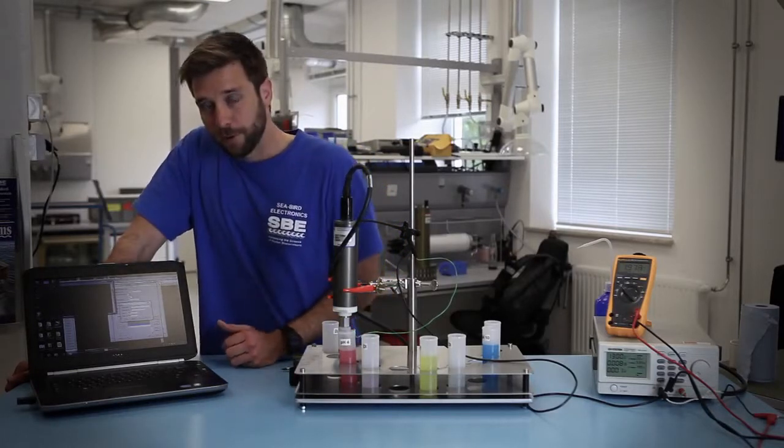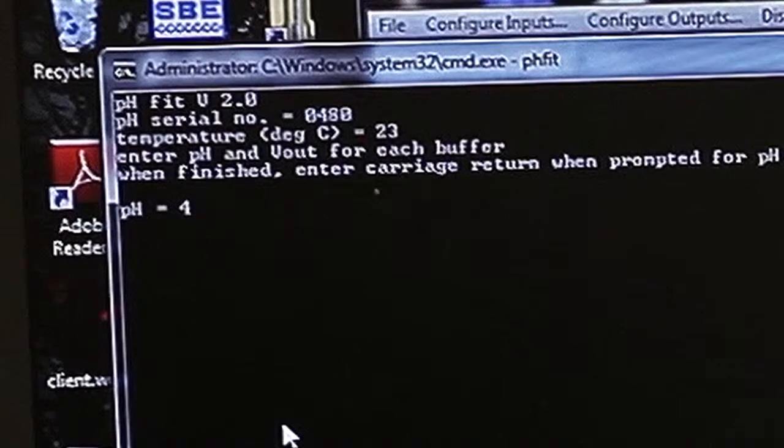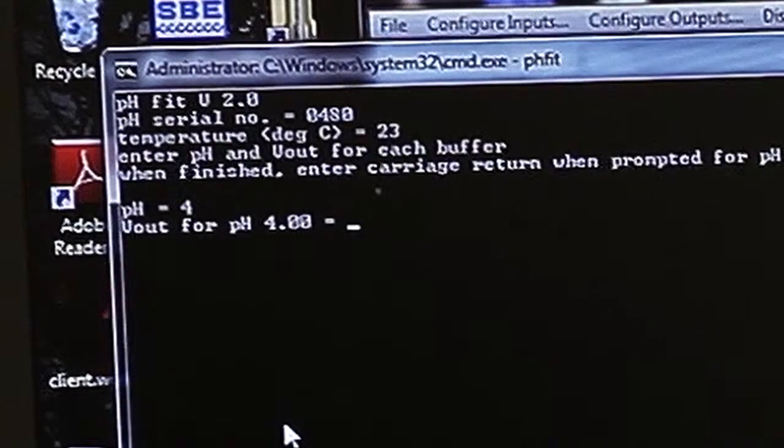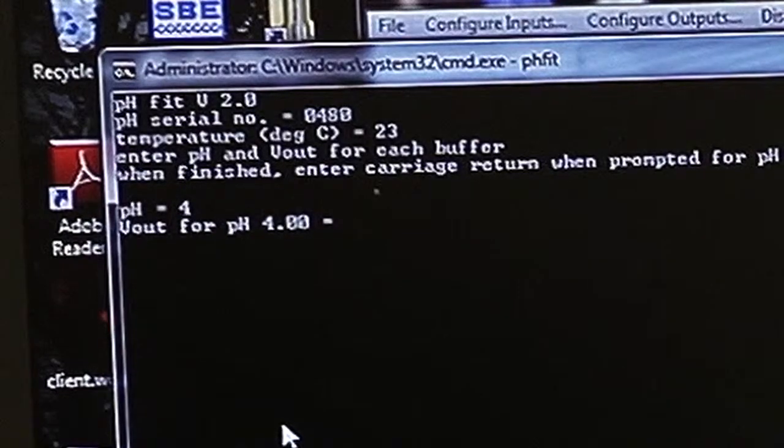Then it asks you for your first pH solution which we'll enter as 4 and the voltage output on the multimeter for the pH probe which for this is 1.977.